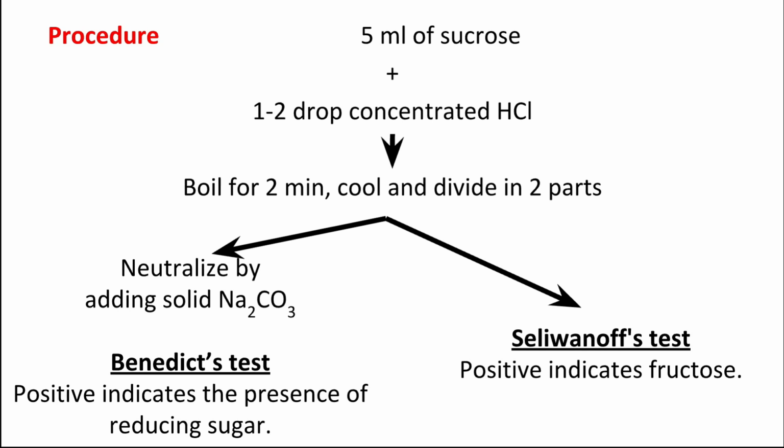First we have to do the Benedict test without hydrolysis, and then we add the concentrated HCl and do the hydrolysis, and then do the Benedict as well as the Seliwanoff test. Okay, so now let's see how the test is being performed.